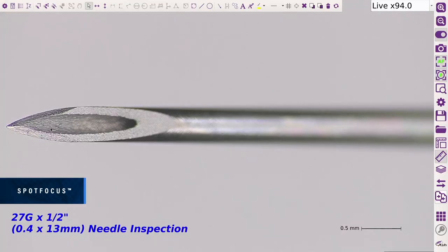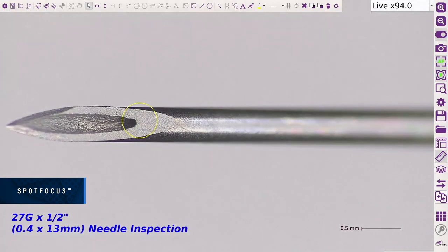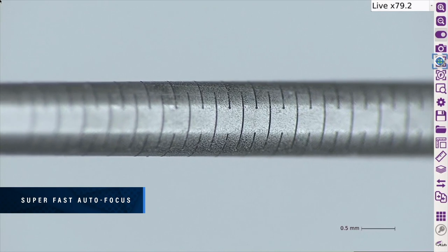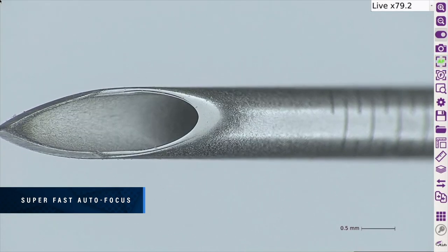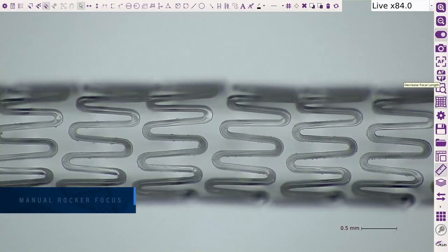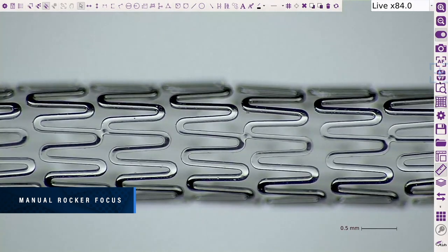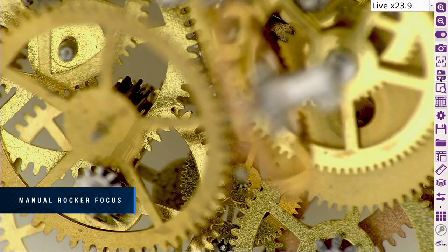Spot focus will rapidly focus on the part, improving focus accuracy and reducing human error, significantly speeding up your inspection time. The AshCam Plus focus time is super fast — place any part under the camera and it will immediately adjust the focus without having to manually adjust focus or change the height of the part. Quickly adjust the focus level on your part by selecting near or far focus using the manual rocker icon.